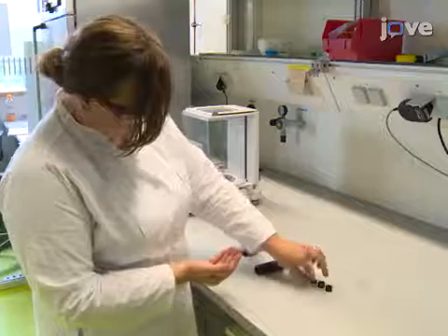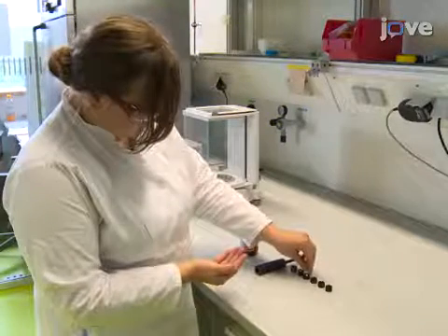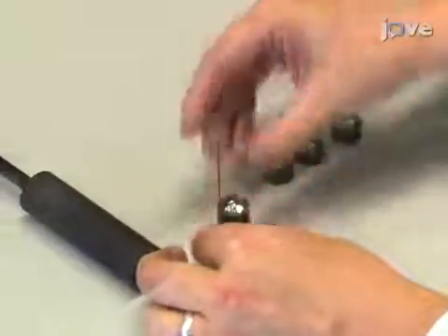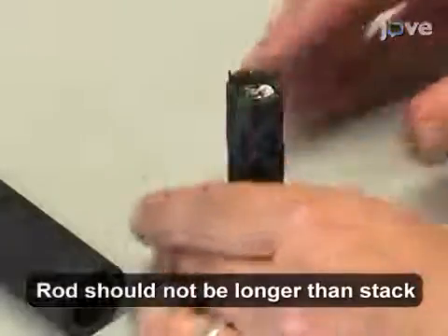First, fill 5 reaction chambers with 6 grams of elemental tin. Stack the reaction chambers over a terminal ring, each of them twisted by 30 degrees, and fix the stack with a 0.7 mm graphite rod.